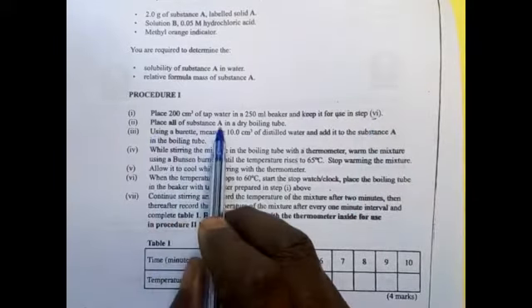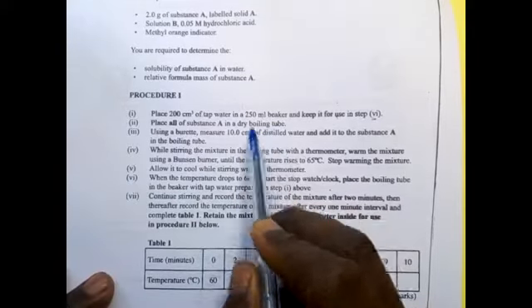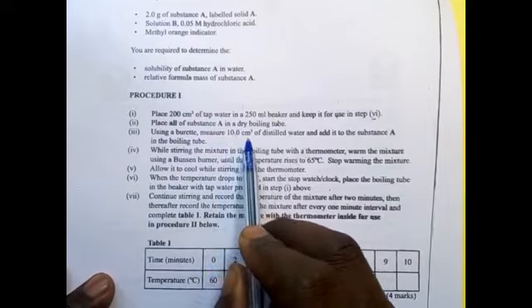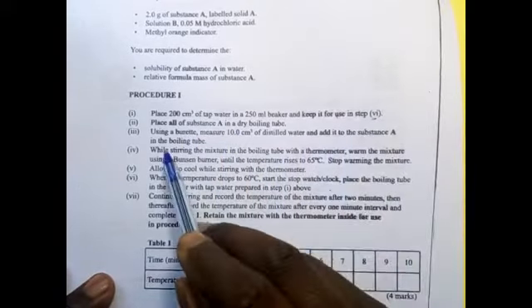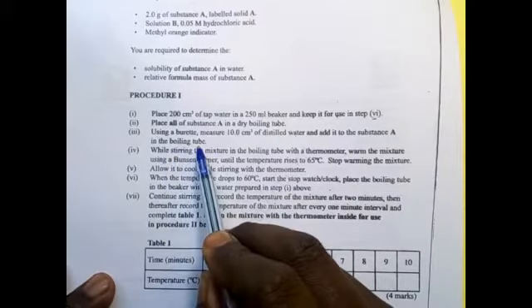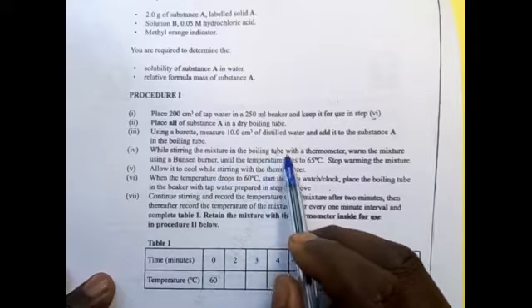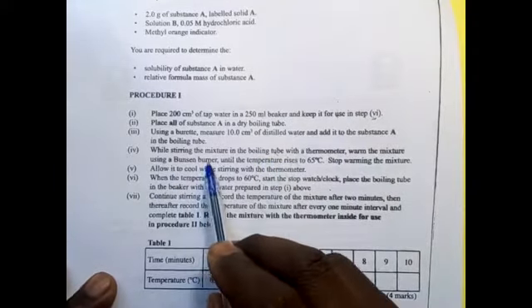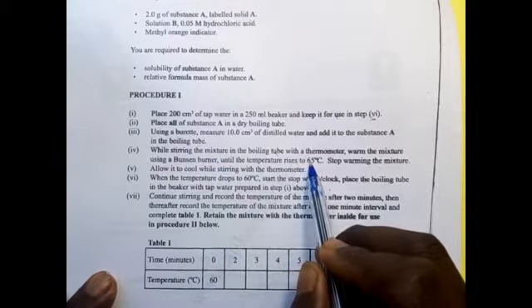Place all of substance A in a dry boiling tube. That is the next thing. Using a burette, measure 10 centimeters cube of distilled water and add it to substance A in the boiling tube. While stirring the mixture in the boiling tube with a thermometer, warm the mixture using a Bunsen burner until the temperature rises to 65 degrees Celsius.